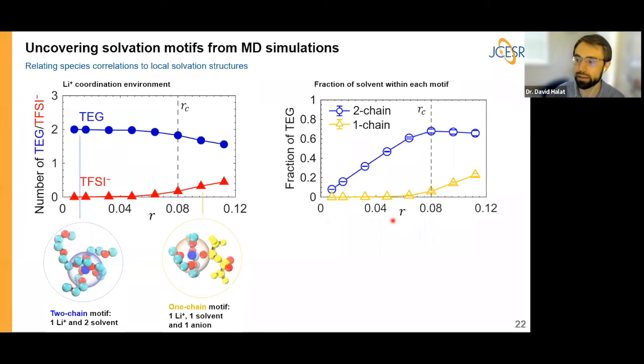And so actually, we can understand this critical salt concentration as the point at which the number of lithium cations is exactly half the number of solvent molecules. That would lead to a prediction of this happening at R equals 0.1 because there's 5 oxygens in tetraglyme. And that's not too far off from where we actually see this maximum, at about 0.08.